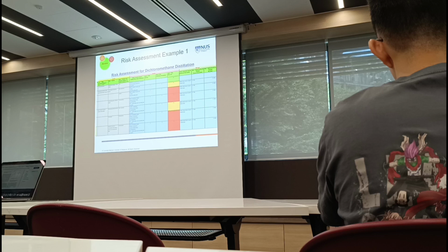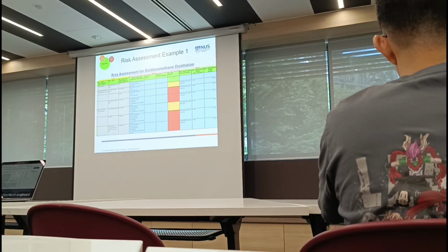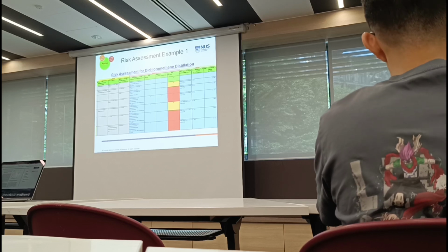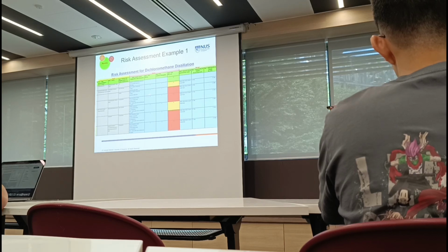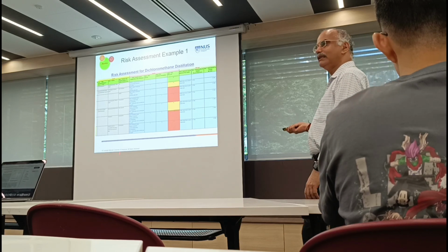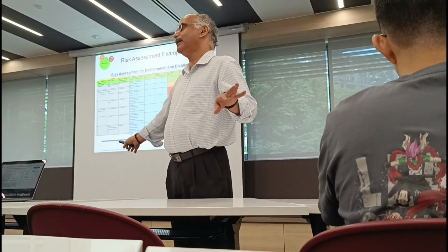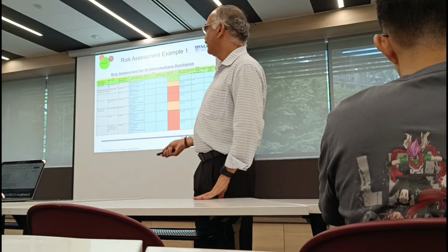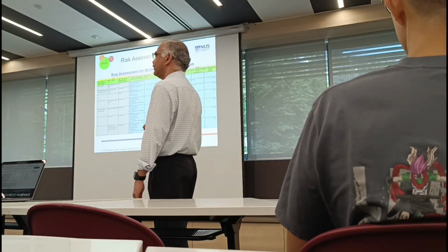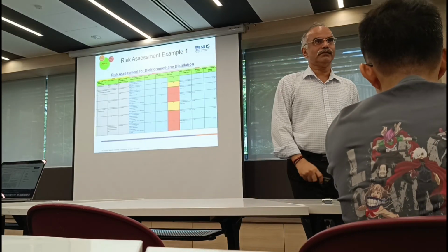Now, in many cases, what the students usually do, again, these will be picked up by auditors, right? Then they go through your risk assessment. Everybody doesn't want to put anything above high. So every step they talk about is always 1 and 2. But that's not true, right? You need to look at the stuff carefully and then assign. Don't just put random numbers like 1 or 2, irrespective of what you're going to do. Then it looks like all small numbers. So these numbers should correlate with your steps, what you're going to follow. And correlate definitely with the hazards associated with it, right?